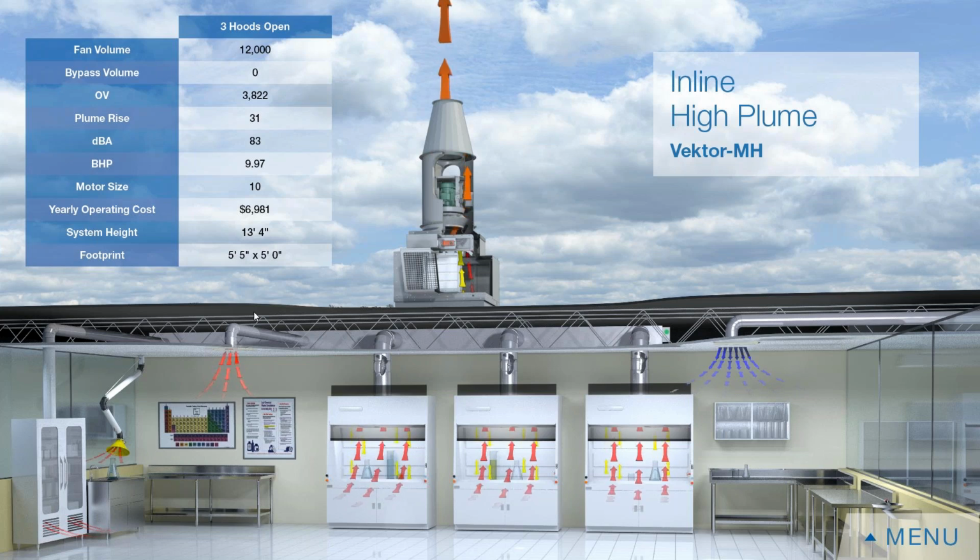No problem. So talking about the lab and the overall space below, before we actually start getting into the fans, there are 3 control loops that stay the same throughout every lab that you'll encounter. First control loop is going to be the face velocity. So the hood velocity, the air moving across these hoods. Typically that's going to be around 80 to 100 feet per minute. You usually won't see anything too much faster than that. If you do, you run the risk of ruining whatever you are working on in that space. So typically 80 to 100 feet per minute is what we see. So that's control loop number 1.